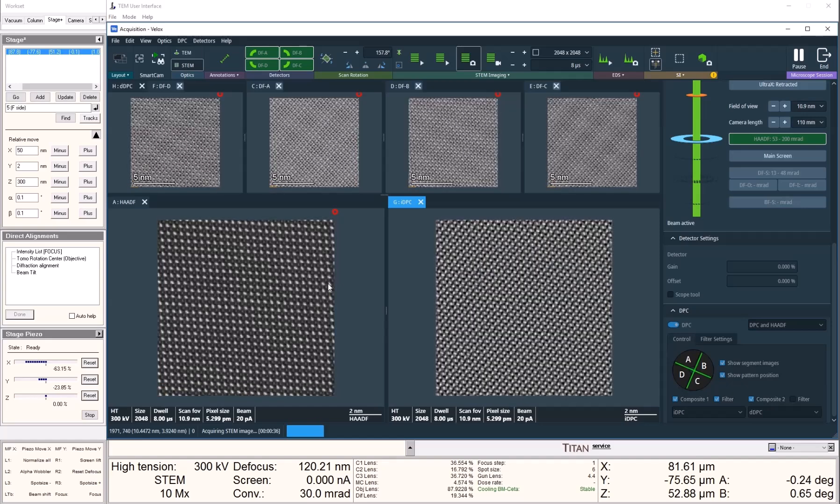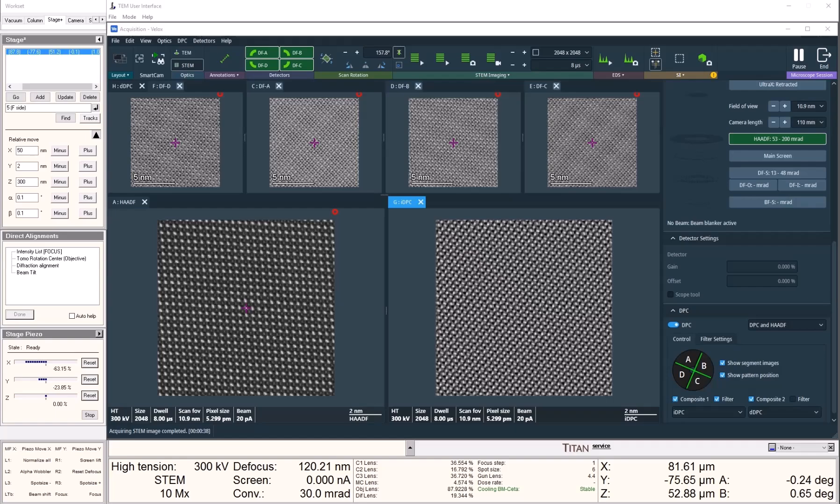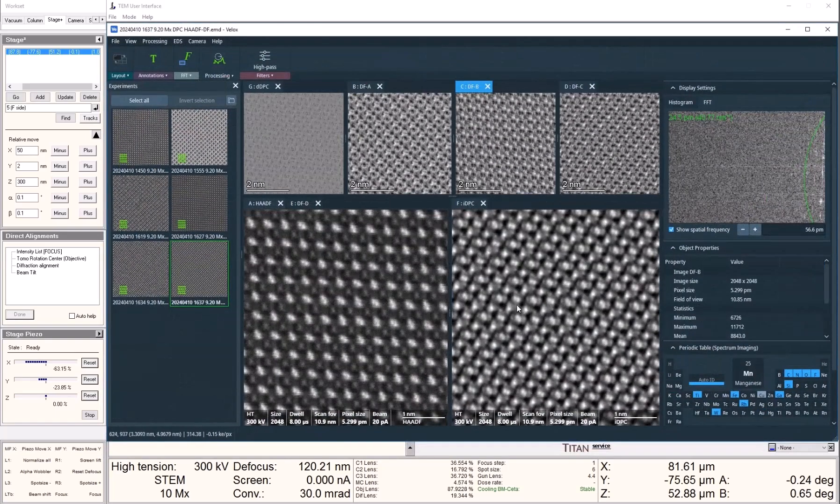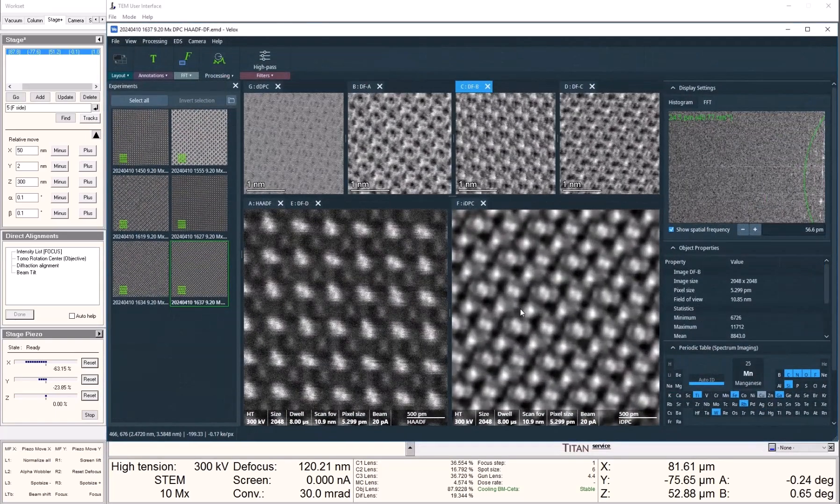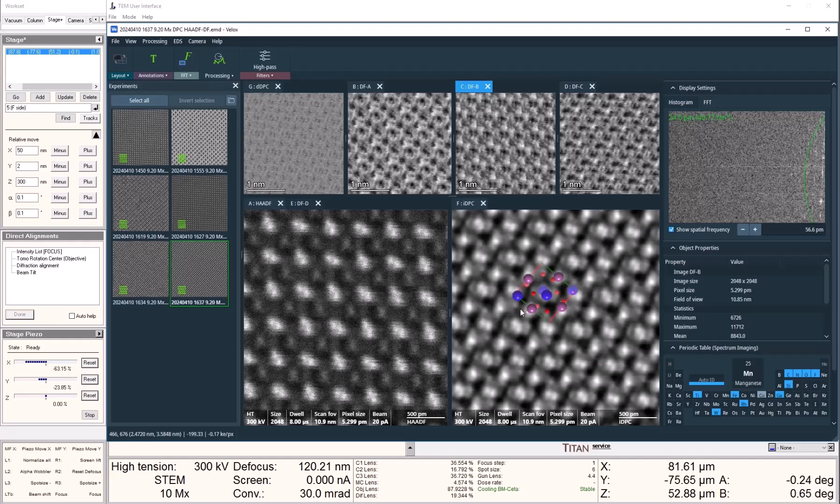When this is finished, we can open the Velox processing window and it will show us the IDPC image that we just took. Here we can see that the oxygen atoms become much more visible compared to the HAADF image on the left.